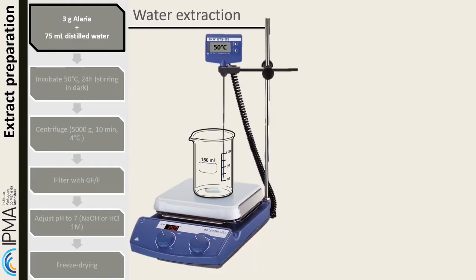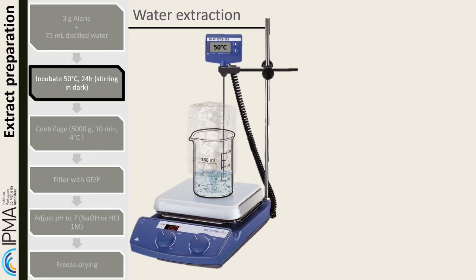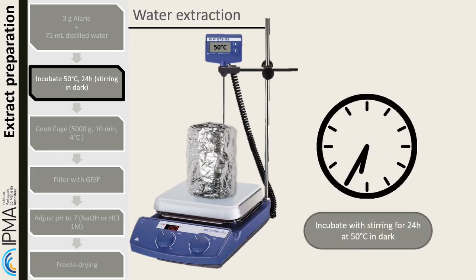For the aqueous extract, start by adding 75 milliliters of water to a beaker on a magnetic stirrer. Add the dried Alaria and heat the mixture to 50 degrees Celsius. Incubate in the dark for 24 hours.